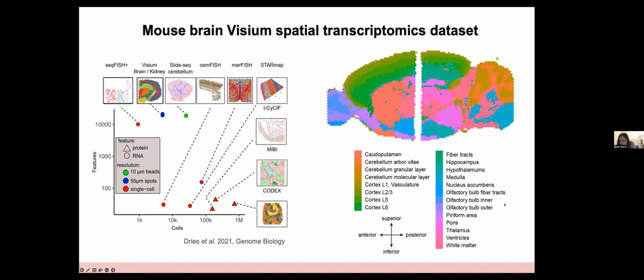Hi, quick question. Although you mentioned in the paper that metacell methods are comparable, would you recommend one of these methods in specific cases or data sets? I would just recommend the one that is included with hdWGCNA out of convenience, because I can't see a clear advantage in any of them.